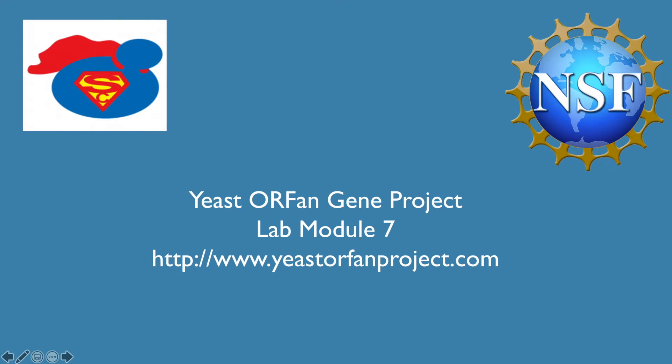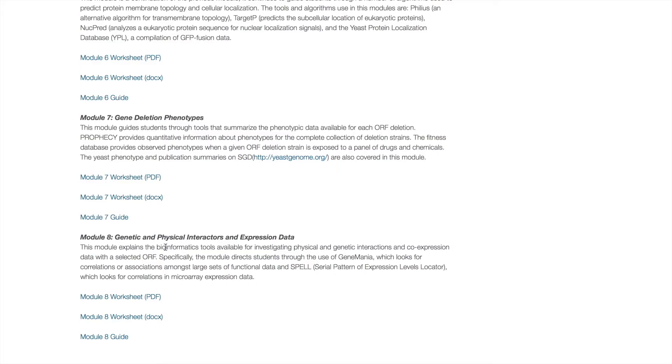Hello everyone, my name is Abby and I'm going to be walking you through lab module 7 of the Yeast ORFan Gene Project. Your gene of unknown function most likely was included in the yeast deletion collection, and after creation of this collection some basic questions were asked of all of these strains. We will now look at PROPHECY and the yeast fitness database for more information based on this.